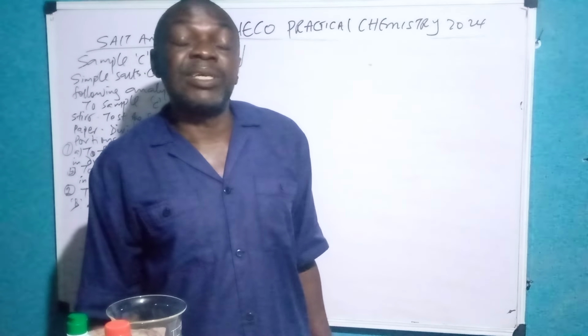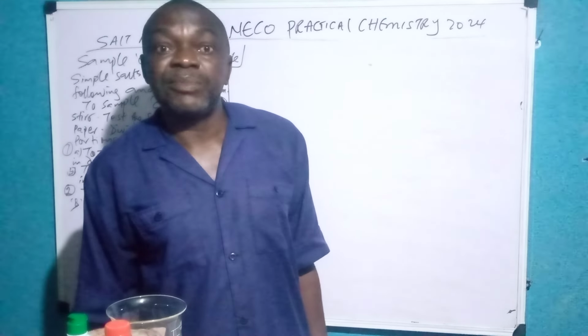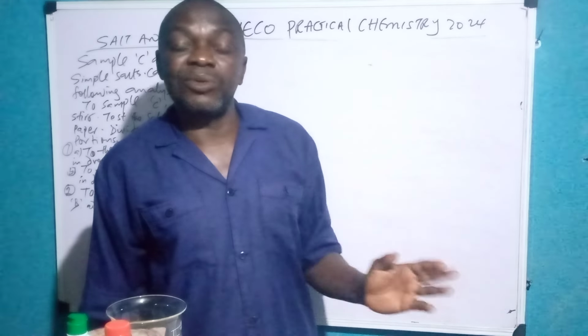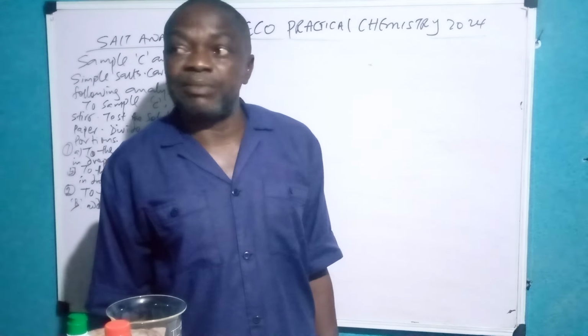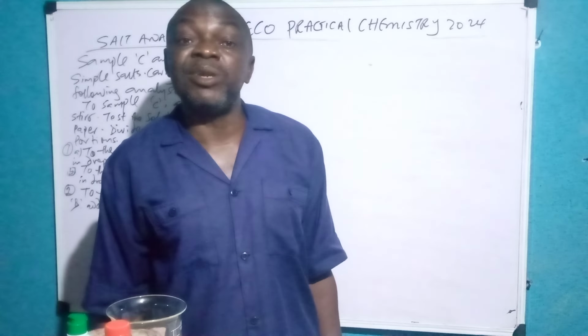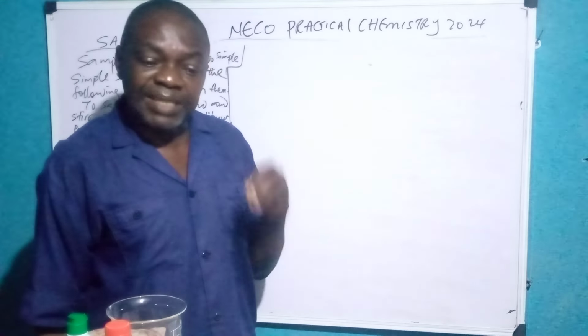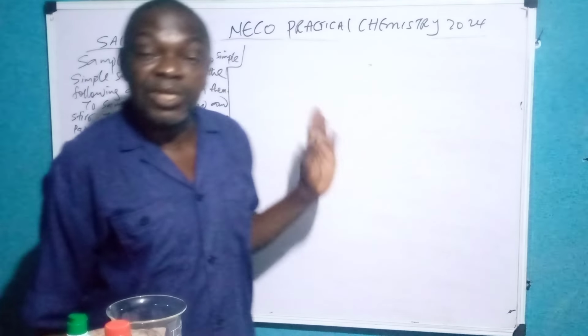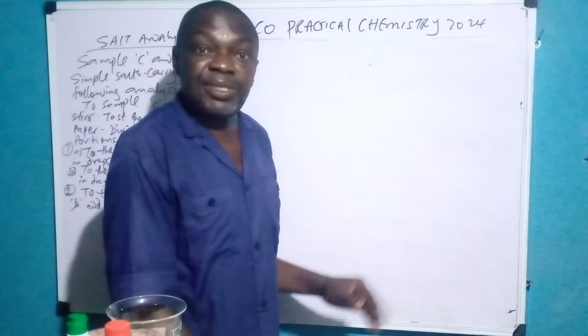However, they said we can use soda lime. Soda lime can also be used, but what we had in the practical aspect did not agree with their theoretical explanation. That is why I'm leaving it out, because the one I did practically did not agree with the theoretical version of it. So that's why I'm omitting it. These are the ones we are going to explain. Just listen and be blessed.